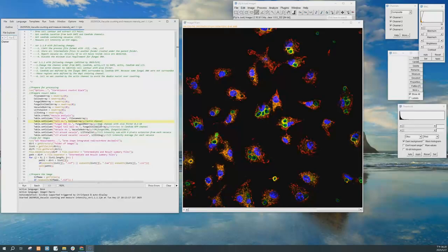We also calculate the vacuoles by intersecting the fungal DNA and cell wall channels. Once we locate the vacuoles, we extend them 4 pixels outward and draw a circle around them. Next, overlay the LC3 channel on this circle. After extracting it, calculate the intensity of LC3. Then calculate the overall intensity of LC3. See how many vacuoles can be separated, thus obtaining the average intensity of LC3.